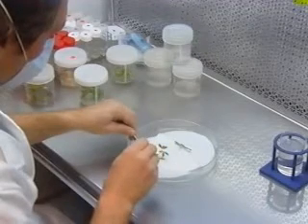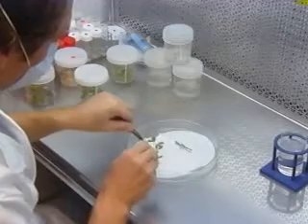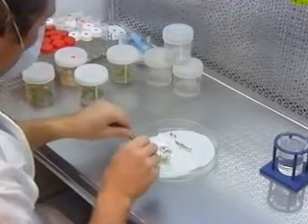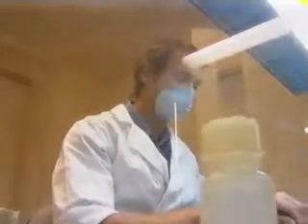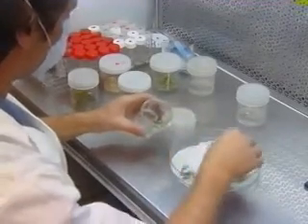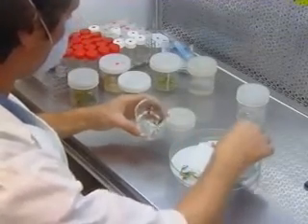Elongated shoots may be laid horizontally on the medium surface, acting as a type of layering, which often stimulates lateral shoots to develop. The number of propagules produced for transfer every 4 to 6 weeks varies from 5 to 25 or more from each explant.